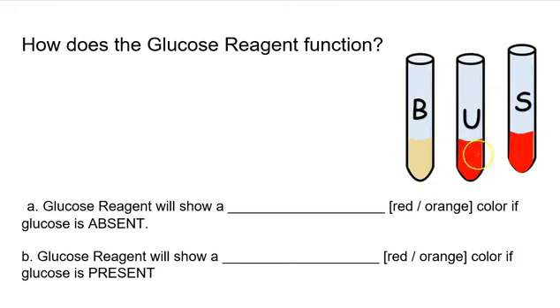So as you can see in our U tube or unknown solution tube and our standard solution tube, we can see the color change from orange to red.